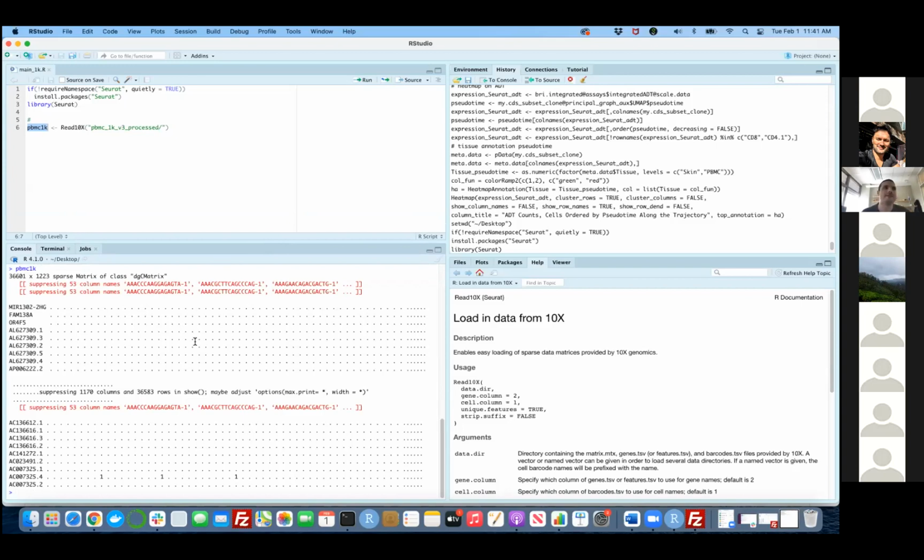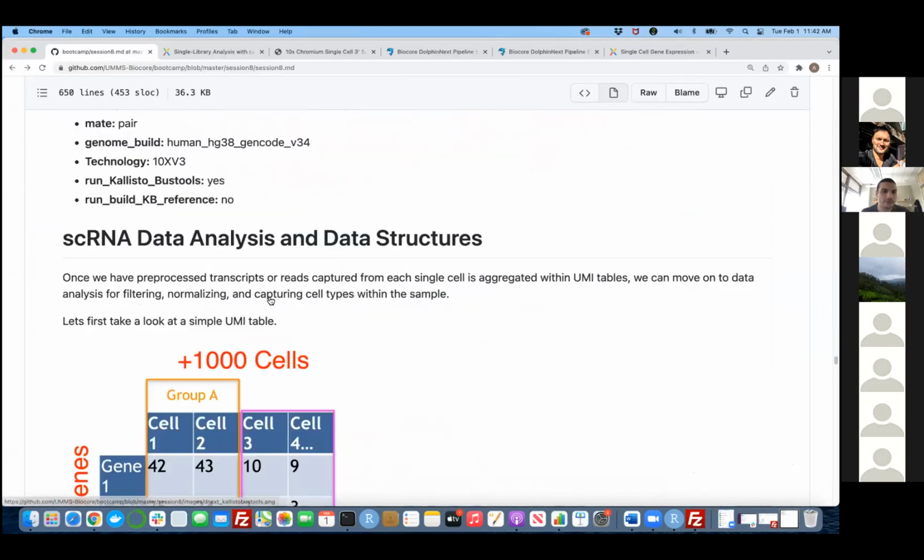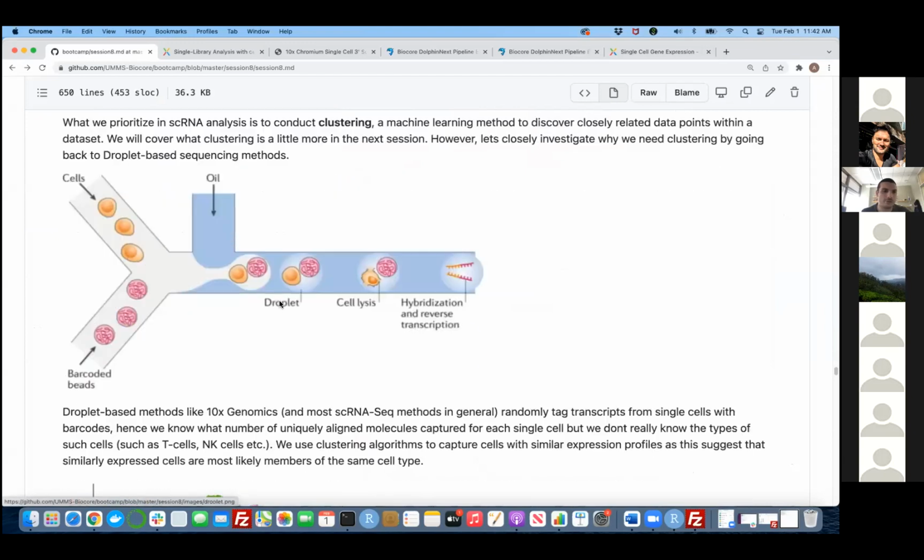For example, let's say that you have some T cells, the CD3 counts of those cells, I doubt that there will be zero, but they will be quite high, right? So the entire reason that we're doing single cell analysis is to understand which of those cells actually have non-zero counts in some of their genes and to identify those genes. So let's quickly take a look at every different thing that we can do with Seurat.